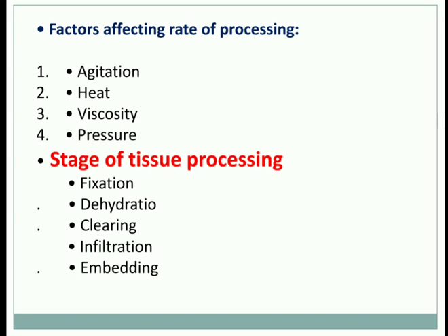Factors affecting the rate of processing are agitation, heat, viscosity, pressure. Stages of tissue processing are fixation, dehydration, clearing, infiltration and embedding.